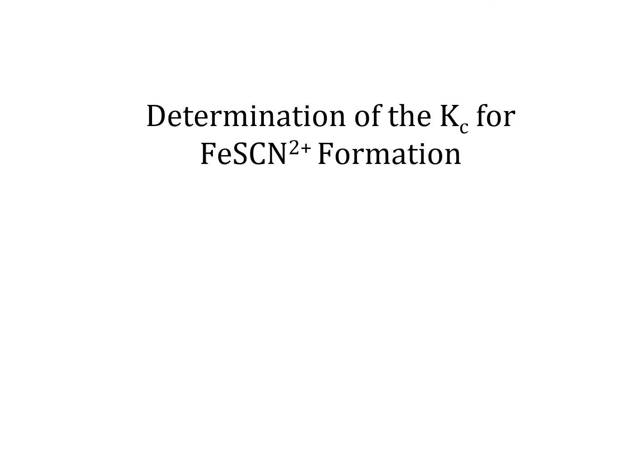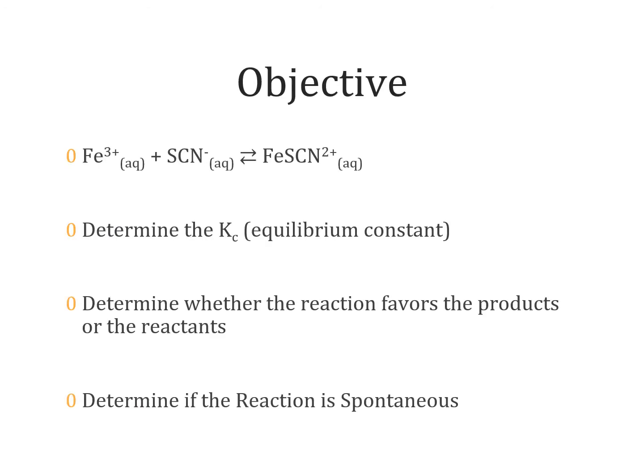And so we are looking at determining the nature of equilibrium between the chemical species leading to this reaction, and we will then calculate the equilibrium concentration of the various species that will help us to obtain the equilibrium constant. And finally, we will be able to relate the equilibrium constant with the Gibbs free energy to determine whether our reaction is spontaneous or not.